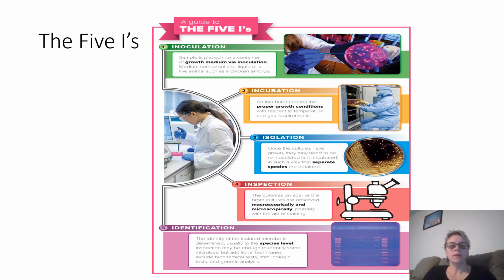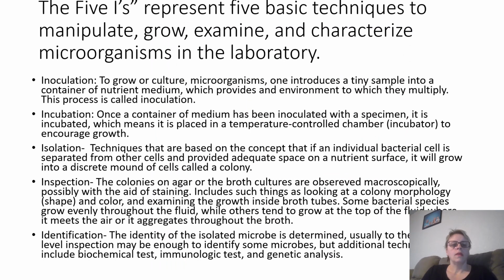The 5 I's: inoculation, incubation, isolation, inspection, identification. The 5 I's represent 5 basic techniques to manipulate, grow, examine, and characterize microorganisms in the laboratory.